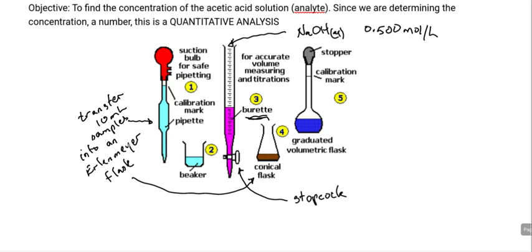Once we open up the control on the burette, the material is going to flow out from there. Again, that's the device that regulates the flow of material out. We're going to start off with our sodium hydroxide solution at a particular height in this column. Now this column has calibration, so you can take a look.